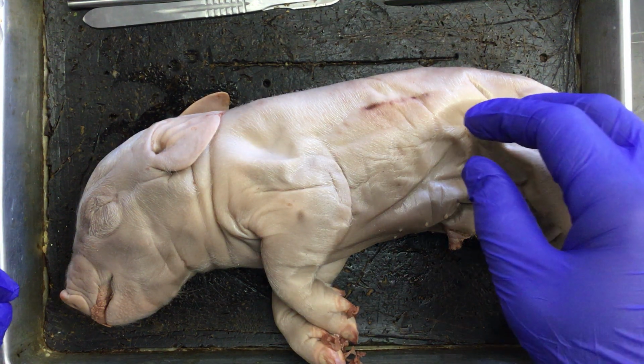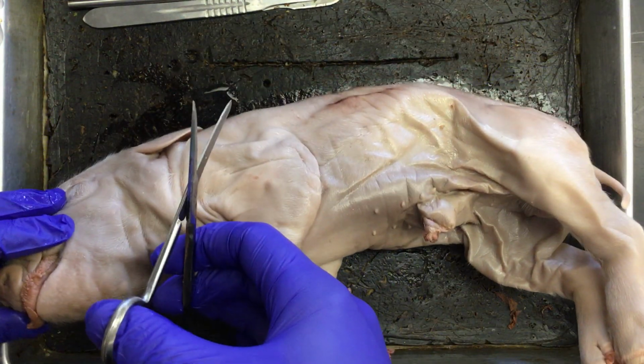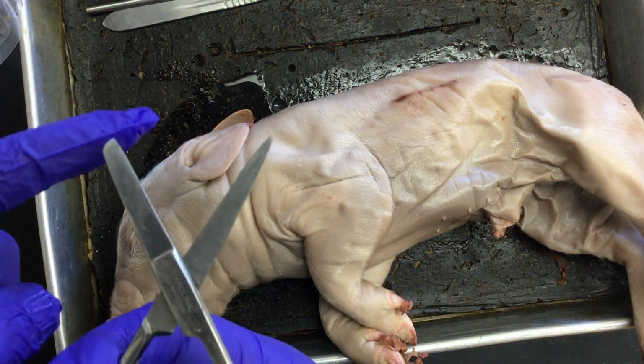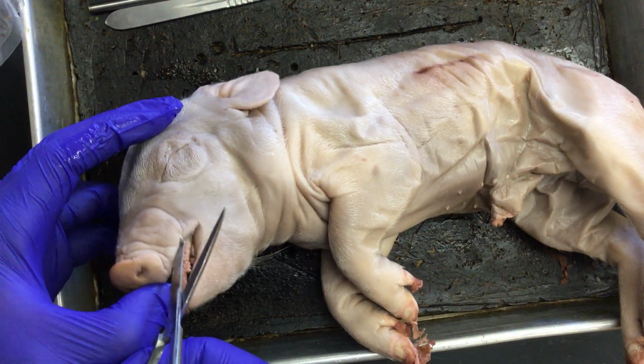Alright, in this video we're going to look at the oral cavity of our pig here. The first thing I'm going to have to do is make an incision with my dissecting scissors along the pig's jaw. Note that I am using the rounded end of the scissors to go into the pig so as to not do any unnecessary tissue damage.